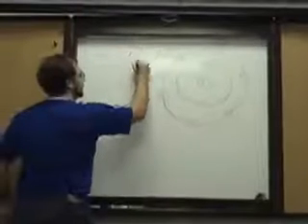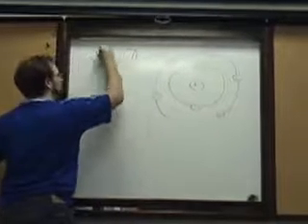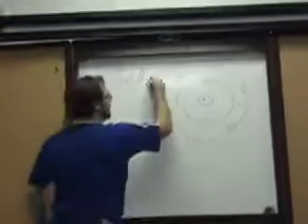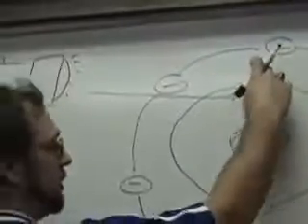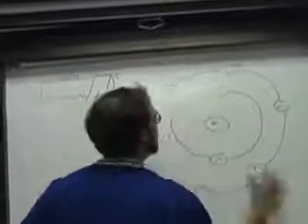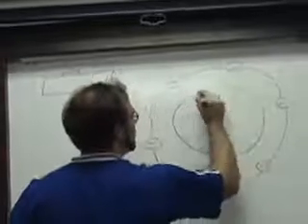What our system is doing is producing X-rays. This is a picture of a flashlight, because X-ray is basically a certain wavelength of light that travels in and gives enough energy to one of the inner electrons. When it does, it gives enough energy for this inner electron to escape. So what we get is effectively a hole right here.